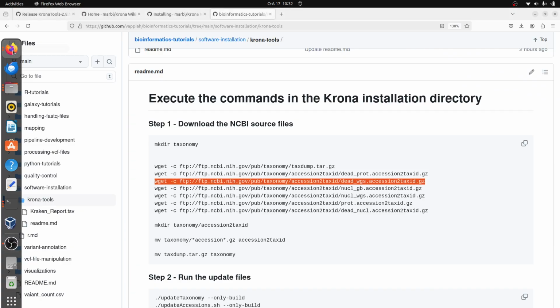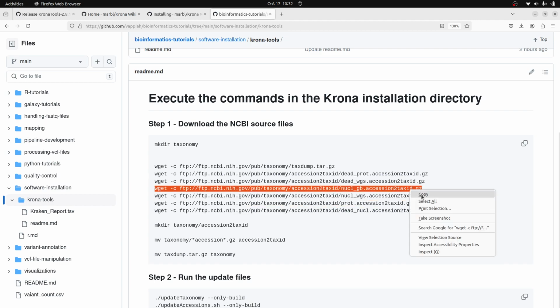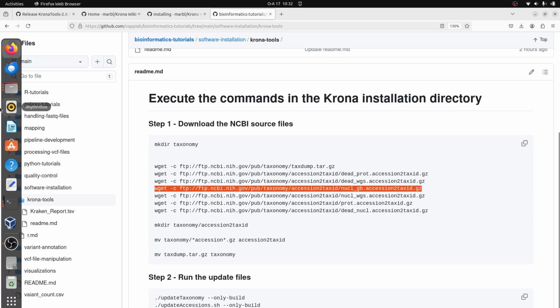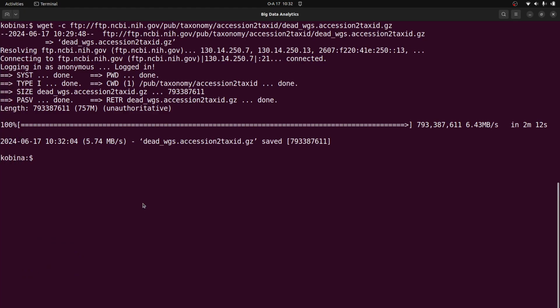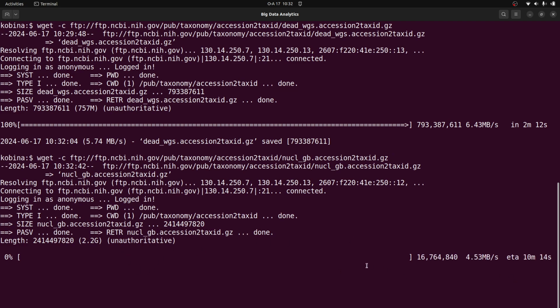Let's go to the next one. That is the fourth one. So let's copy and paste. So there's the fourth one. Let's download it. Okay, there's like 2.2 gigs, so it will take some time. But you need to monitor the progress, which is here. So 0%, now it's 1%. You just have to monitor the progress and it should be done.